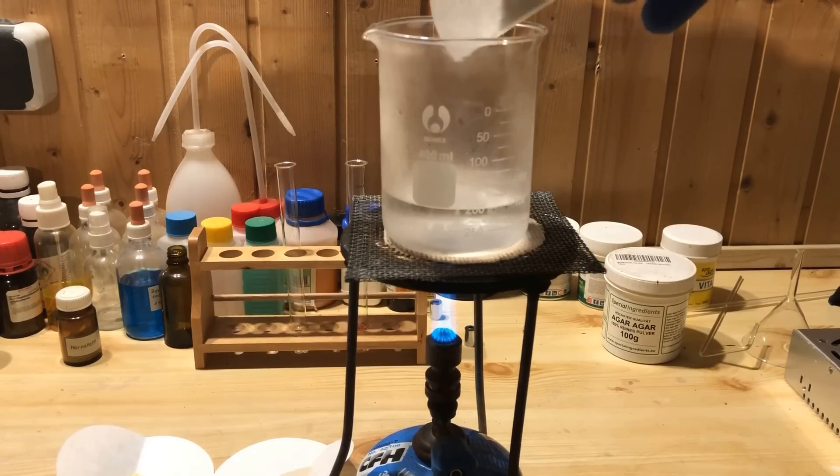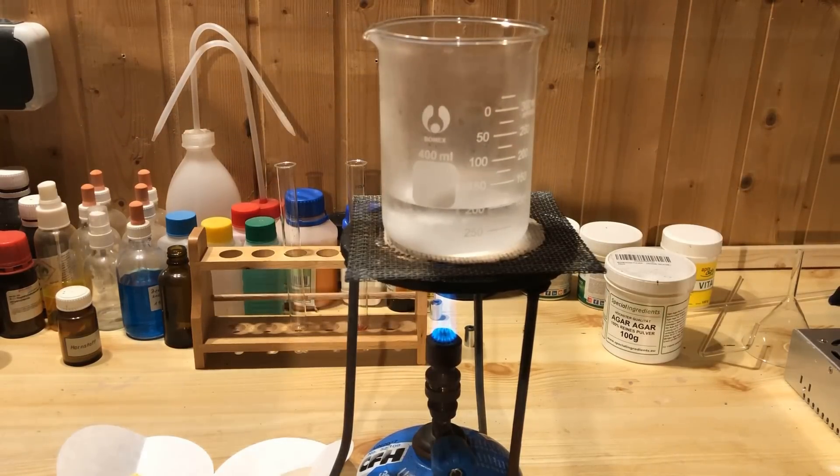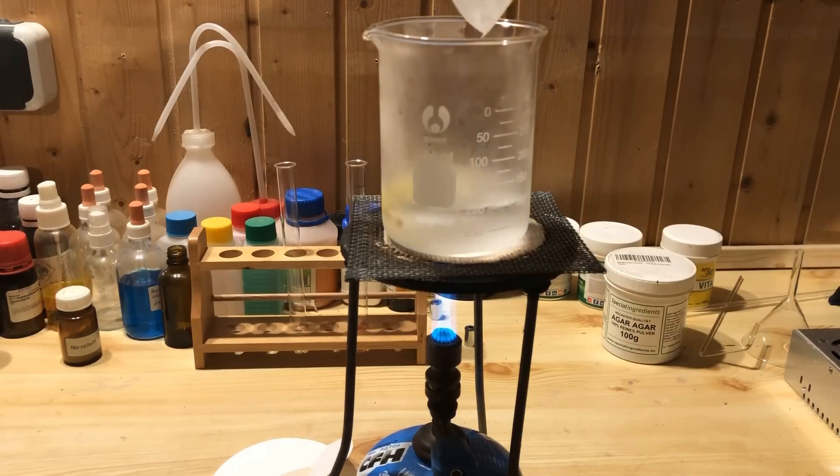We heat 100 milliliters of distilled water in a beaker and dissolve 3 grams of sodium carbonate and 0.3 grams of luminol in it. Sodium carbonate helps the luminol to dissolve in water.